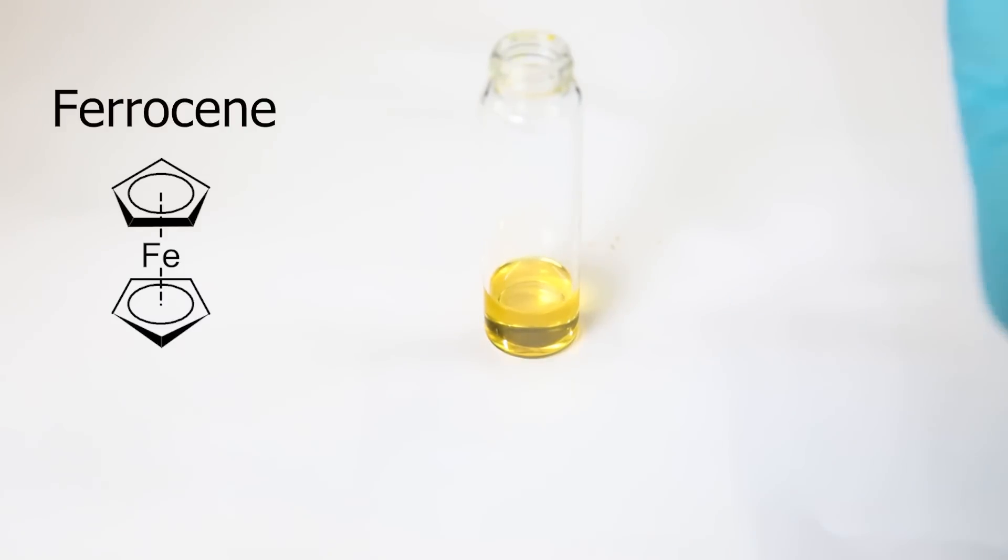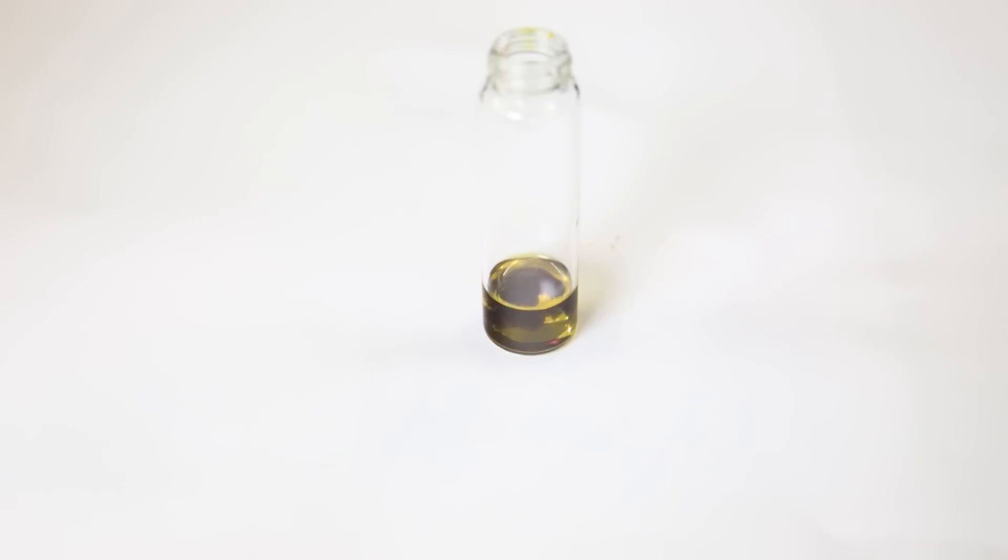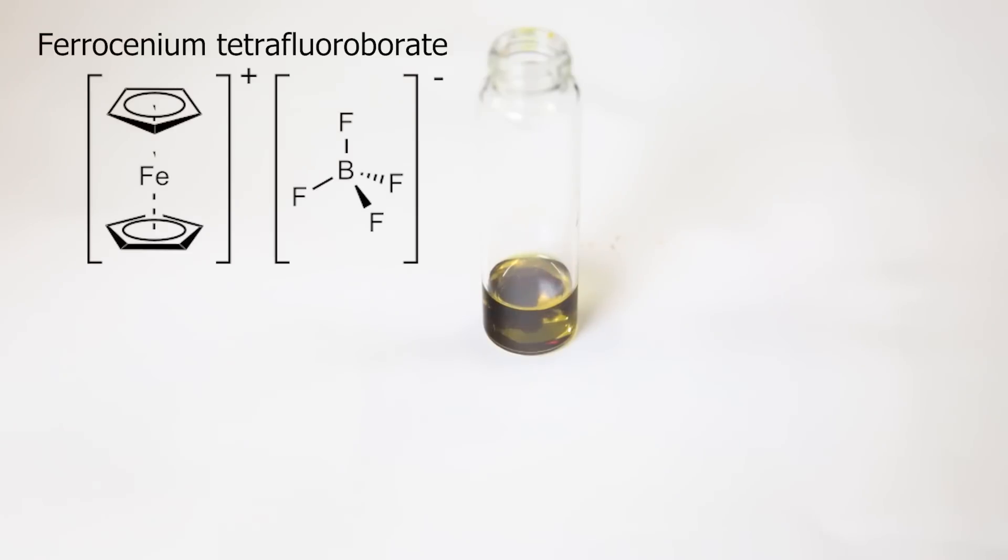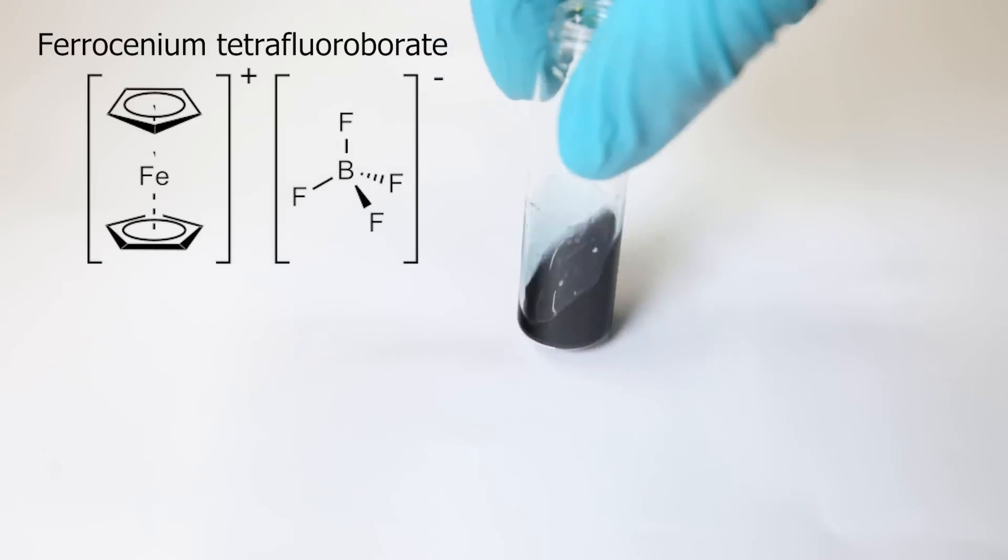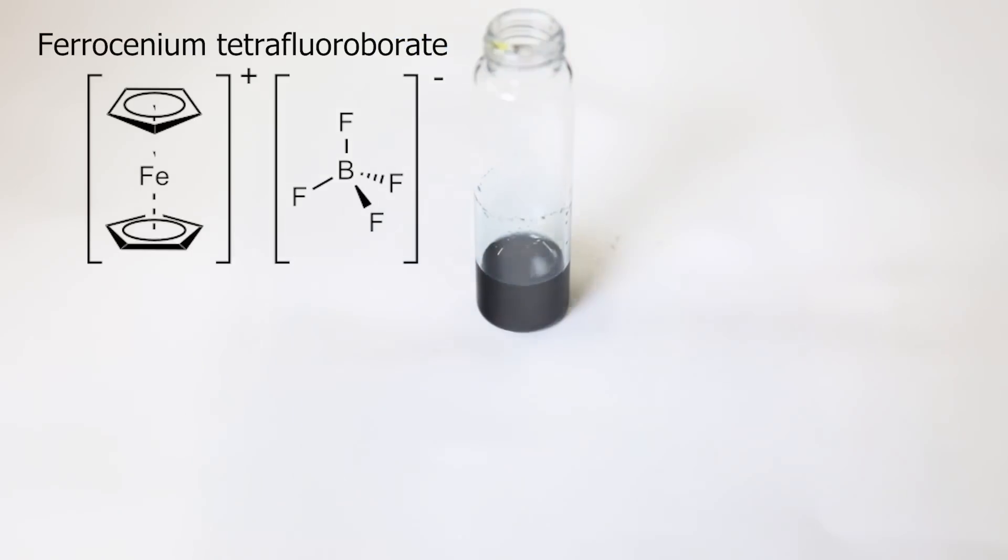When adding the ferrocene, it is immediately oxidized to the ferrocenium cation and then complexes with the tetrafluoroborate ion to form the blue complex ferrocenium tetrafluoroborate. This compound is used as a one-electron oxidizing agent because the produced ferrocene in the reaction is pretty much inert and is easily separated.